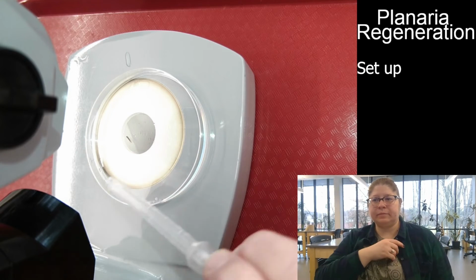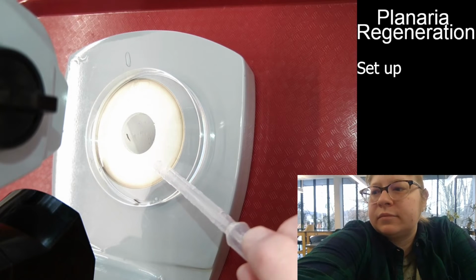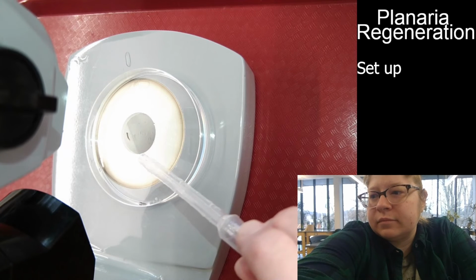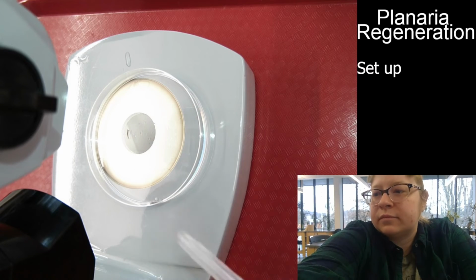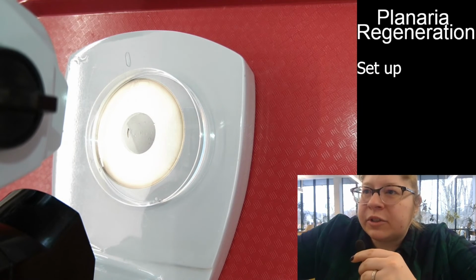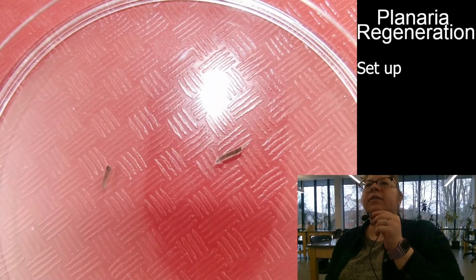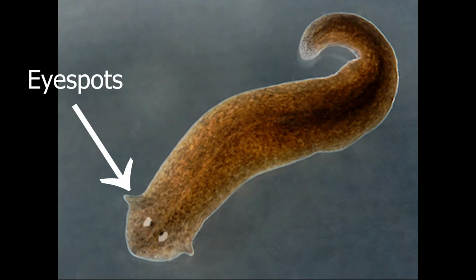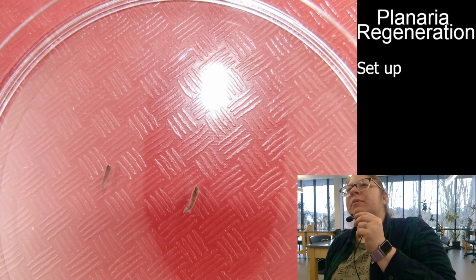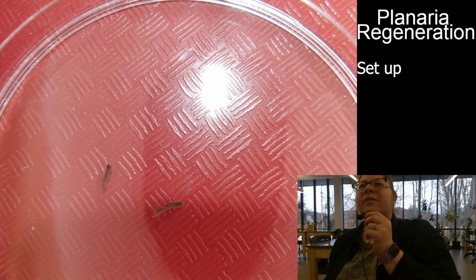I might just interject. If you look here, you can see they're still freely swimming. That piece and the other piece are actually moving quite rapidly across the surface of the petri dish. I'm going to adjust the camera down and see if we can get a better look. And as you can see, the side with the head, you can see those little white eye spots there. It seems to be swimming faster and with a bit more direction, probably because it still has the eye spots.